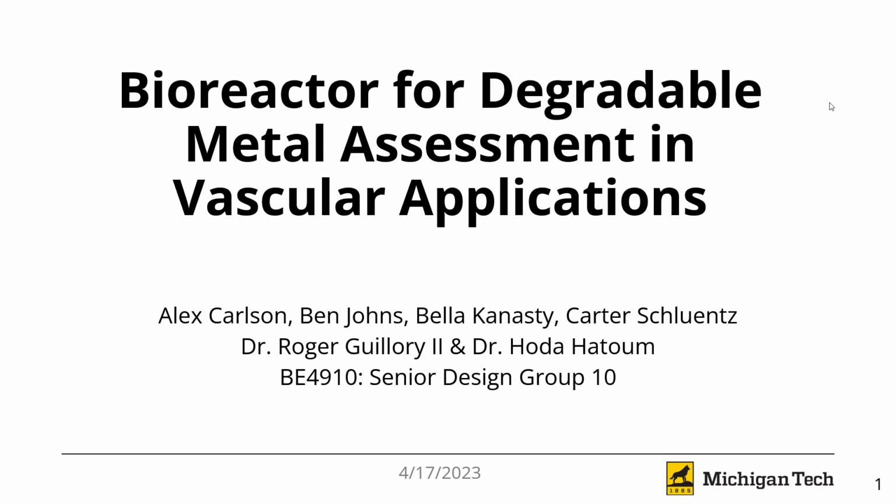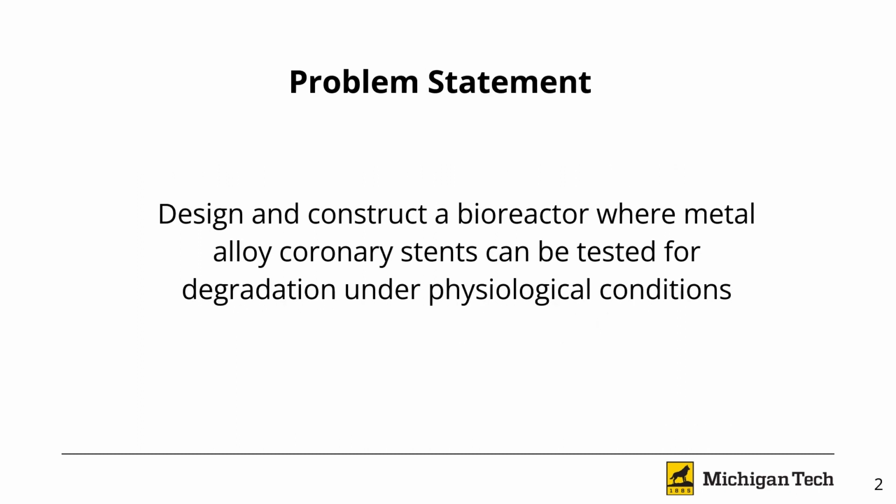So, we are Biomedical Engineering Senior Design Team 10, consisting of Ben Johns, Alex Carlson, Bella Kanasty, and Carter Schluentz, advised by Dr. Hoda Hatoum and Dr. Roger Guillory. We were tasked with designing and constructing a bioreactor where metal alloy stents can be tested for their degradation behavior under physiological conditions.